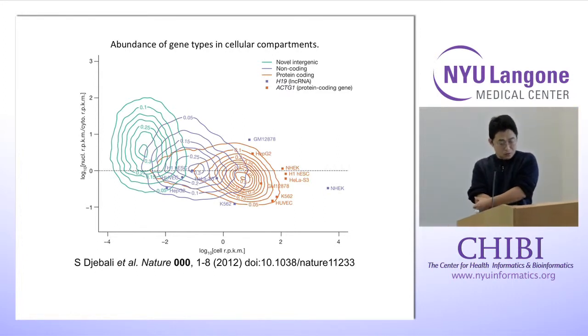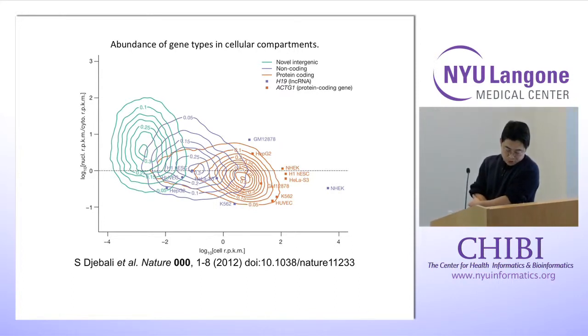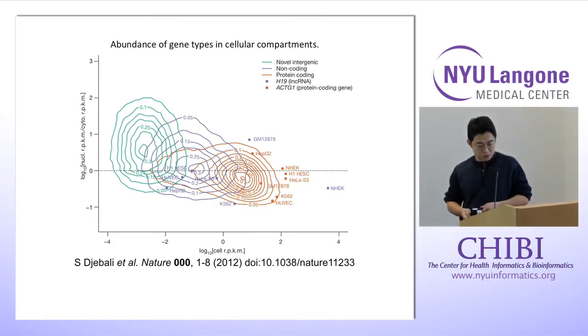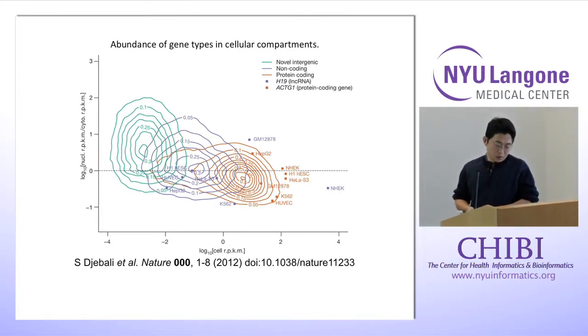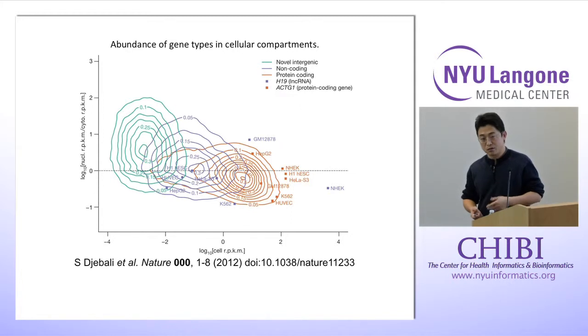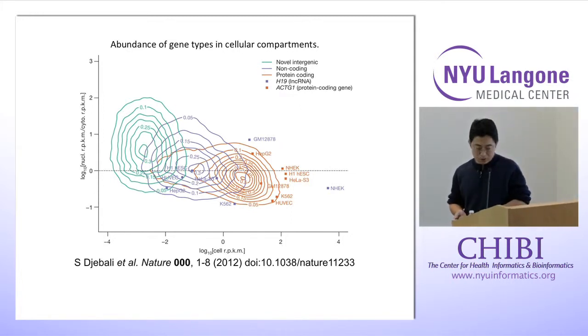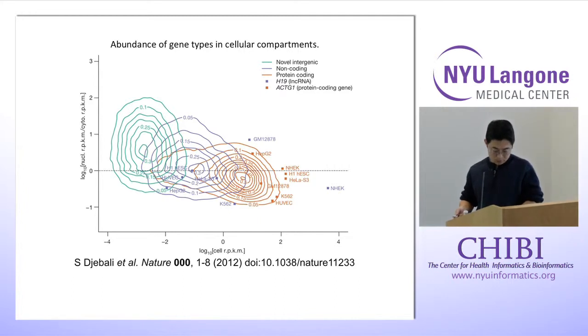We are investigating what genomic features can be associated with that. But this figure just shows the complexity of the transcriptome, so a profiling project needs to consider very carefully how much sequence we need.